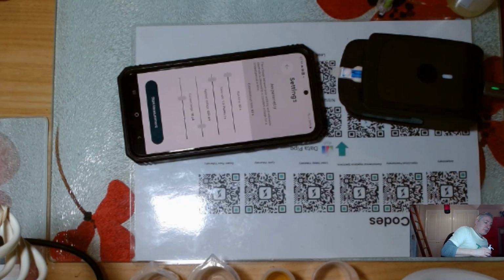I'm just going to grab some peracetic acid. I have done other videos on this as well where I actually prepared the peracetic acid. So I've got some peracetic acid here. I'll just put it into a little pipette and then I'll hit go.